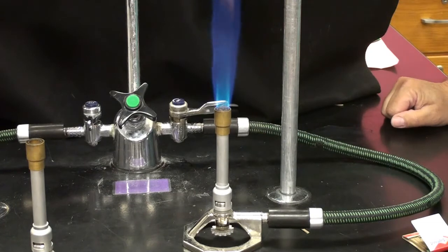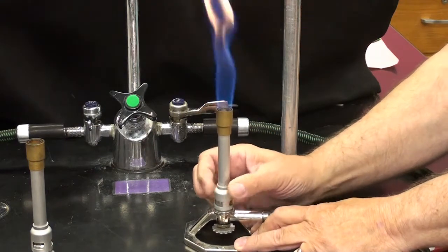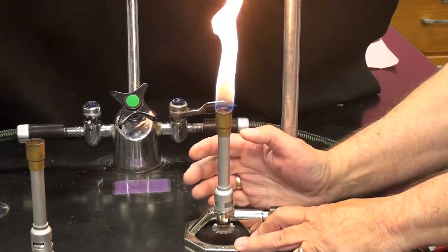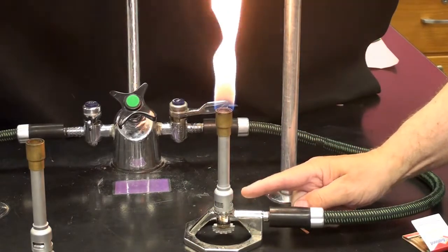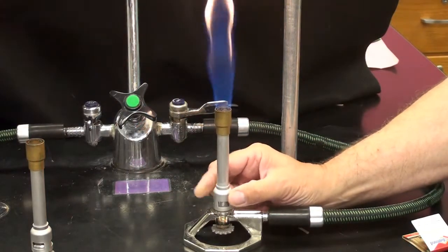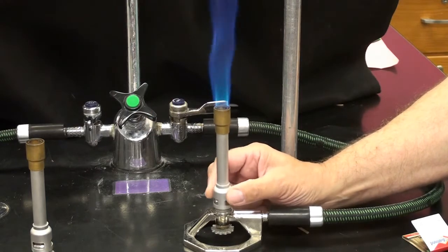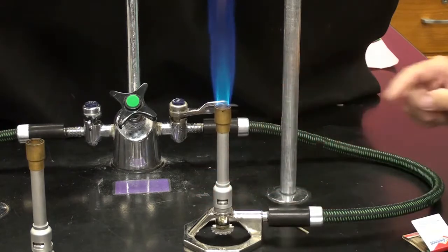Twisting the barrel does kind of the same thing. So I'm gradually closing it up, and look how the flame changes, right, like so. This is without the air going in. And now when I start allowing air to come in, a little hole opens up here when I twist it. It starts going back, right? I'm starting to see that sort of an inner cone over here.